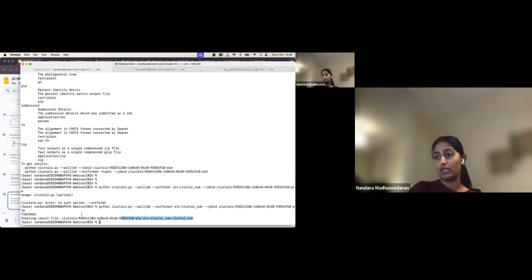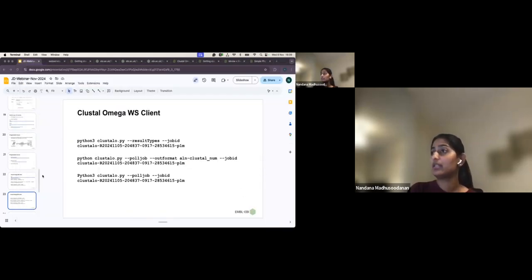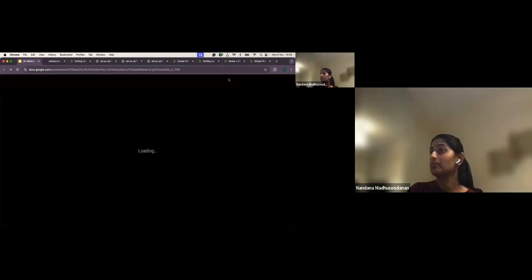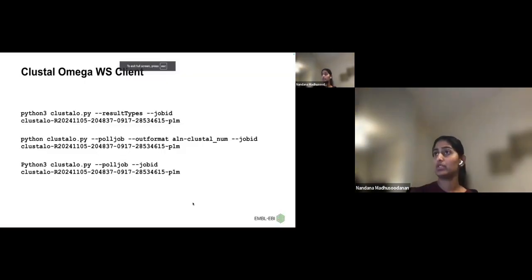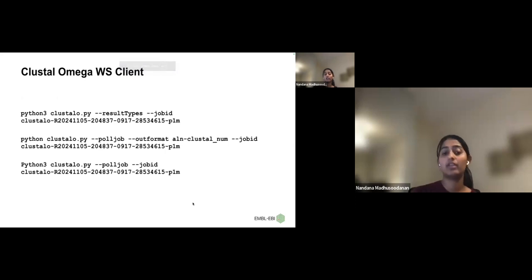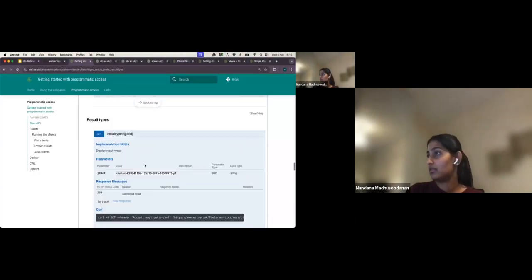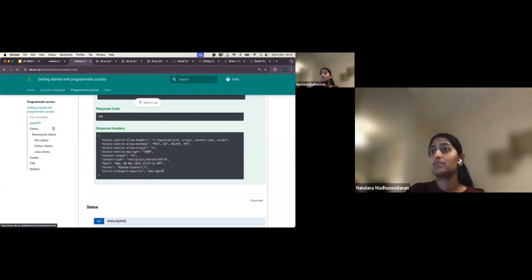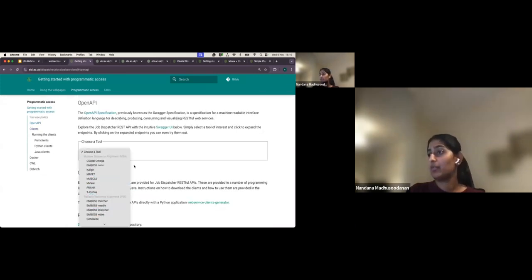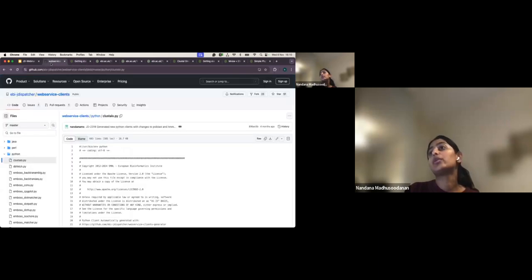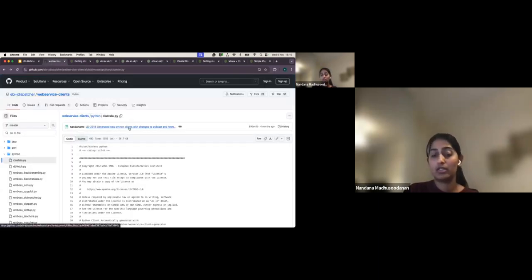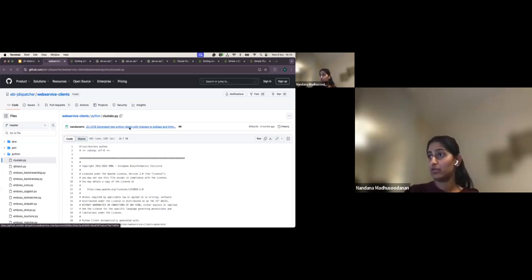That covers how to use the Clustal Omega web service client. You can explore other tools similarly — go to the Git repository and download the web service clients for other tools. Perl and Java options are also available.